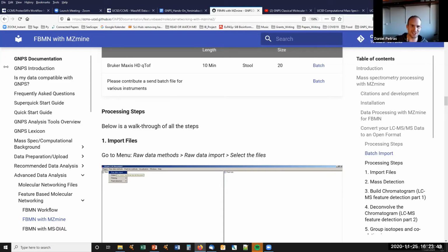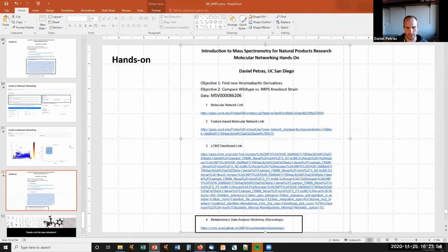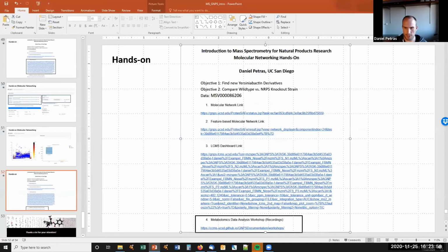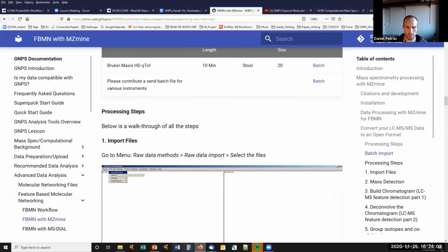This is a very good question. That is a very good indicator of where you actually have isomers, because there are two values you get, and I think the retention time which would be displayed is the average. And maybe, am I still sharing my screen? Yes. Let me go and open my browser.